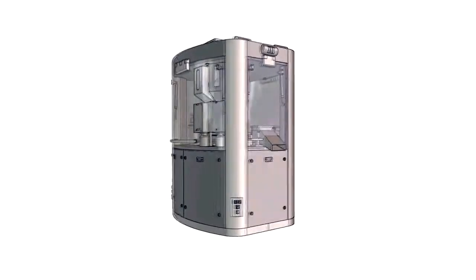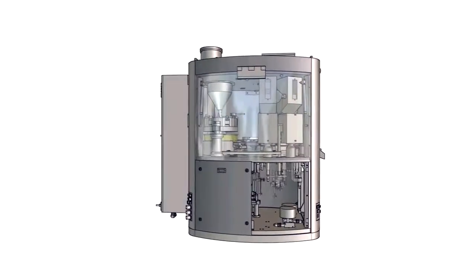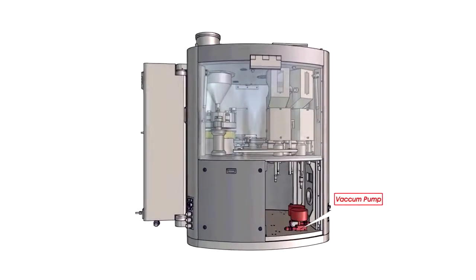Using a low pressure vacuum pump, it can assure the stable vacuum low level over four kilograms and irregular supply air pressure.